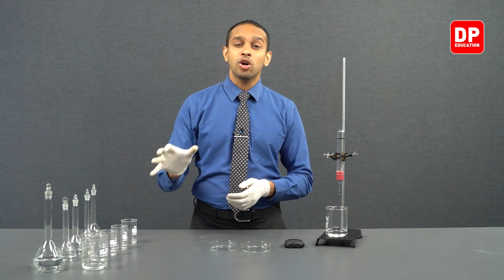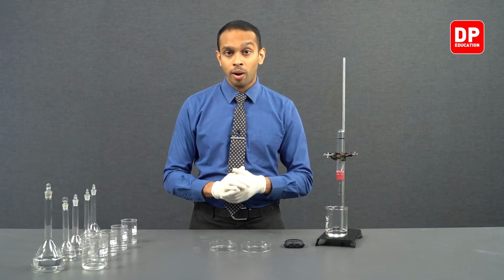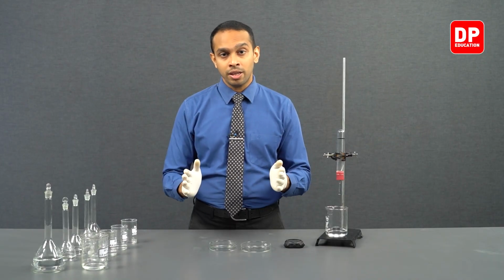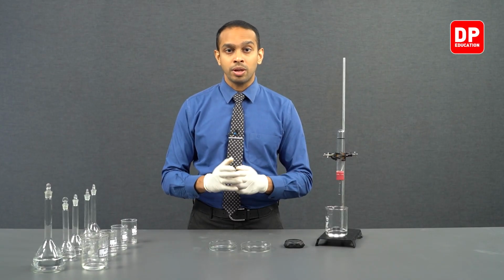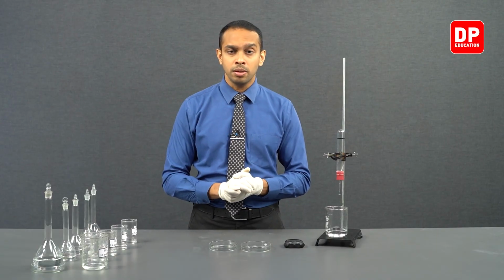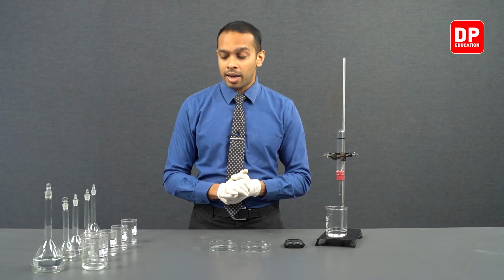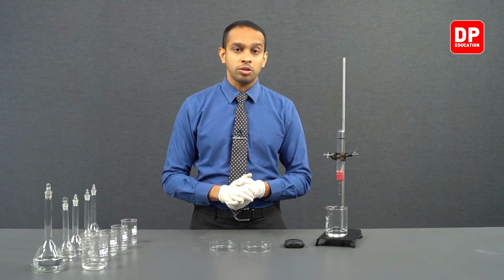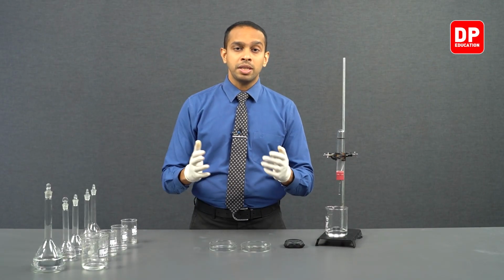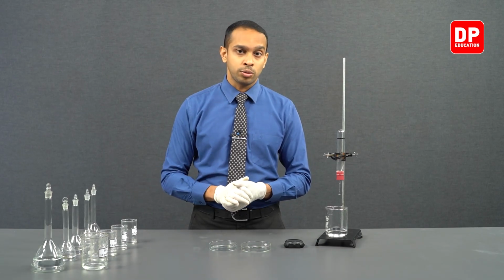So we can very clearly observe, as we increase the concentration of HCl while keeping other conditions a constant, such as the length of the magnesium strip and the temperature. We didn't increase the temperature or decrease the temperature of the system. When we keep other factors a constant and change only the concentration, we observe the rate of the reaction increases as we increase the concentration of our HCl solutions.